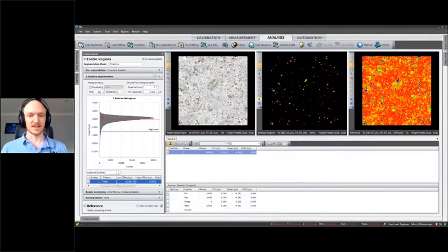And so now you can see we immediately have a change here. All of our pits have been pulled out. And at this point, we've successfully detected the defects on our surface. Now, we've only gone as far as to do the qualitative sort of analysis that we would have done using different instruments. So in this case, we'll actually want to break down each of these regions to perform additional analysis.